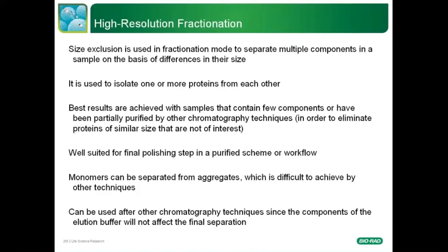High resolution fractionation is well suited for the final polishing step in a purification workflow. Monomers can be separated from aggregates, which is difficult to achieve by other techniques. High resolution fractionation can be used after other chromatography techniques since the components of the elution buffer will not affect the final separation.